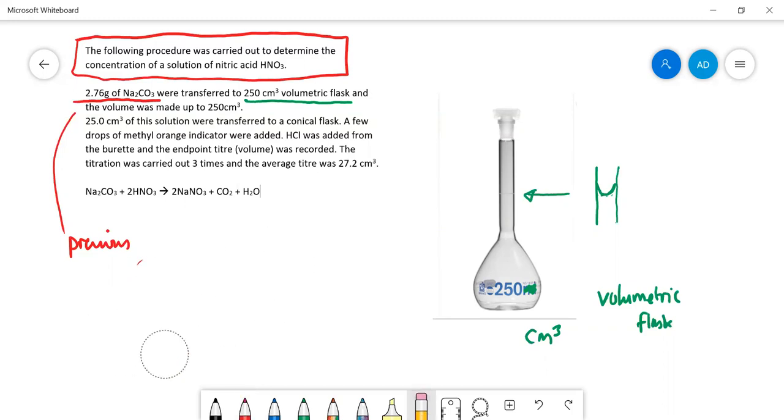The other advantage of doing this is you can do this multiple times. In this experiment, you can just keep pipetting out 25 centimeters cubed at a time into your conical flask and doing the titration. You could actually do it 10 times, but you probably only have to do it three times and then you get an average value.